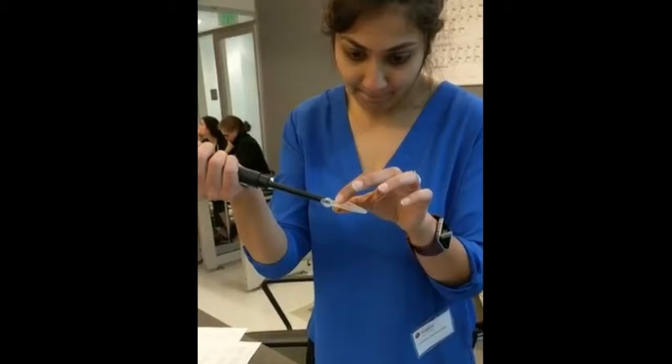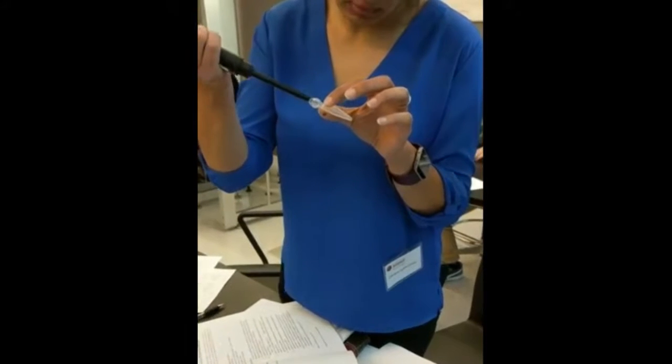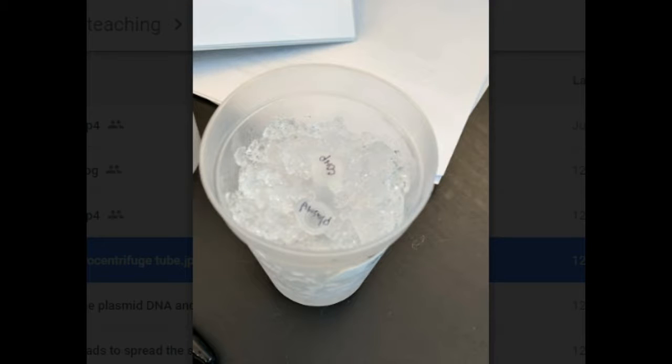You're going to pipette 25 microliter aliquot of Z competent cells from the microcentrifuge tube and add it to the microcentrifuge tube containing 2 microliters of plasmid DNA. These materials should be kept on ice, okay? Before you put them on ice, you're going to mix them gently by flicking the bottom of the tube.